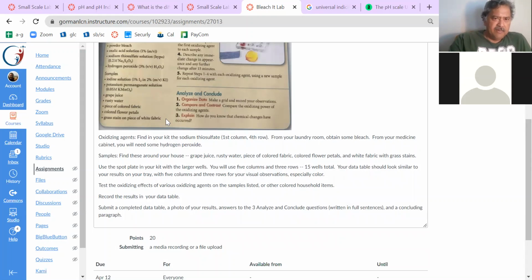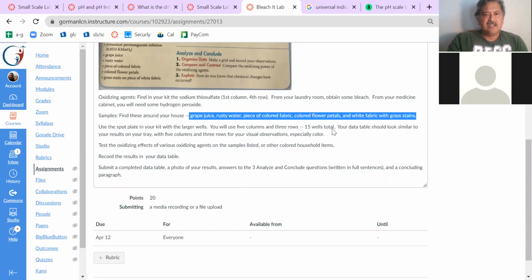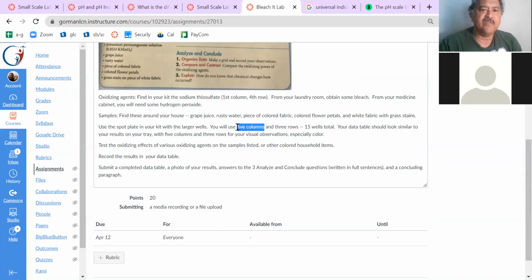So the number of wells that you need depends on the number of things that you get. There's 1, 2, 3, 4, 5, 6, 7 things here. But over here, I said, all right, around your house, here are things you have a chance at finding: grape juice, rusty water, piece of colored fabric, colored flower petals, and white fabric with grass stains. These are the 5 most practical things I think you have the possibility of finding. If you find those 5 things, you need 5 columns. If you only find 4 things, then you need 4 columns. If you only find 2 things, then you only need 2 columns.